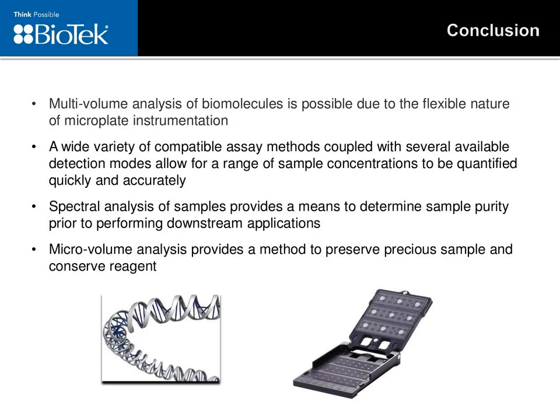So in conclusion, I'd just like to reiterate that multi-volume analysis of biomolecules is possible due to the flexible nature of microplate instrumentation, where a variety of different vessels are available to perform those different assay types. And there's a wide variety of compatible assay methods that can be coupled with the various detection modes that are available on these multi-mode instruments. And we can do a wide range of sample concentrations as well by using different volumes.